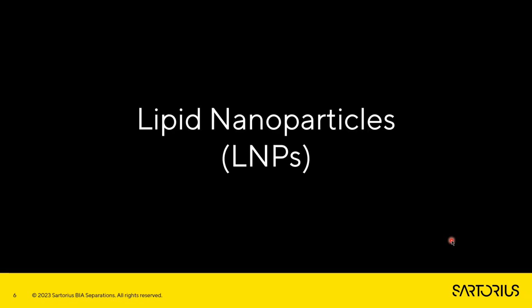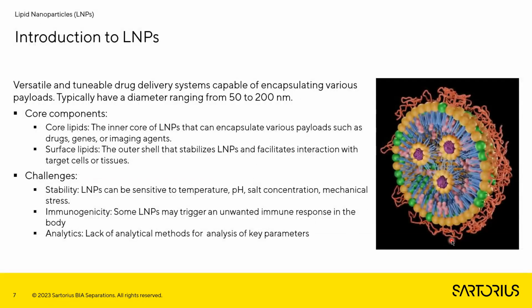So let me start with a short introduction about lipid nanoparticles. Lipid nanoparticles are a versatile and tunable drug delivery system capable of encapsulating various payloads. Their size ranges from 50 to 200 nanometers. The structure of lipid nanoparticles can be divided into two parts: the inner part of the particle, where the payload is encapsulated, and the outer shell of the particle, which is responsible for the stability of these particles. We encounter different challenges regarding LNPs.